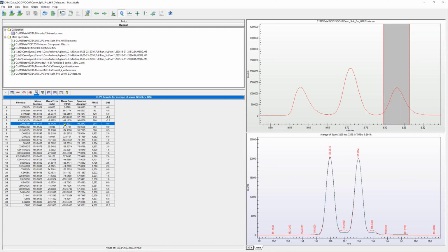But as we get up closer to the top here we have something that's about 96%. It's got a pretty good match. There's some things lacking down here. On uncalibrated data, you'd start to run into real problems. In fact, you'd probably run into struggles, like we said, at about 90 or 80% spectral accuracy. And if we go to the top here, and we're overlaying this compound, the theoretical over the calibrated mass spec, it matches really, really well, over 99% spectral accuracy.